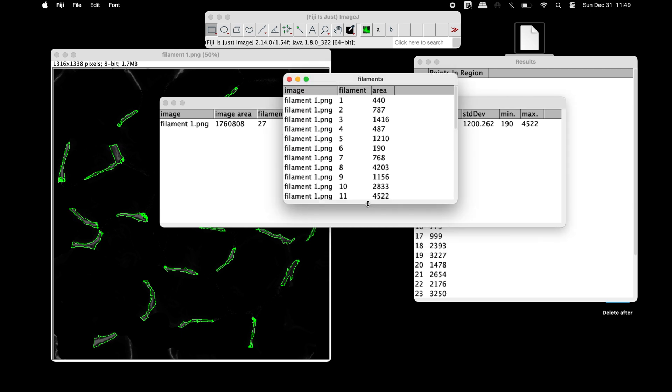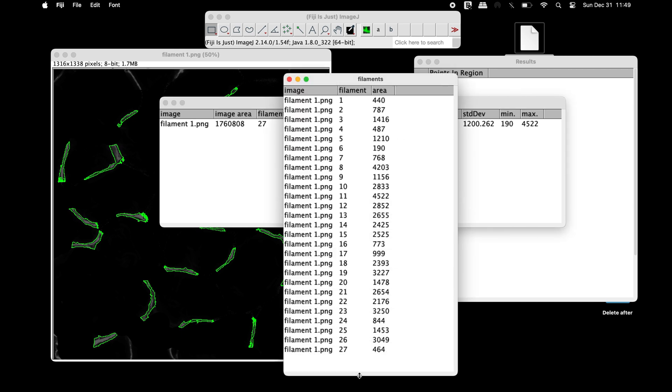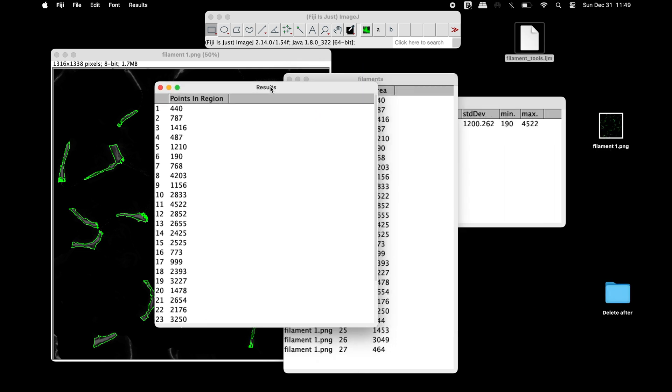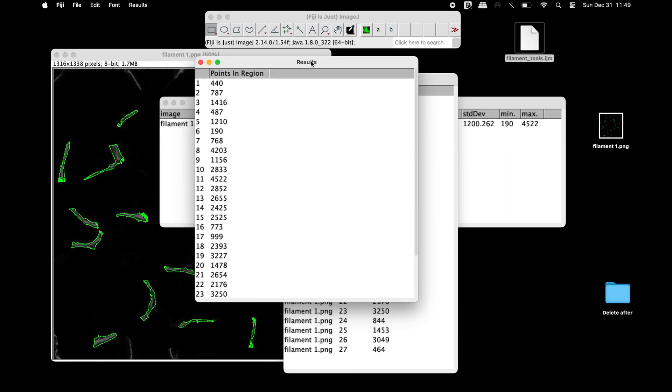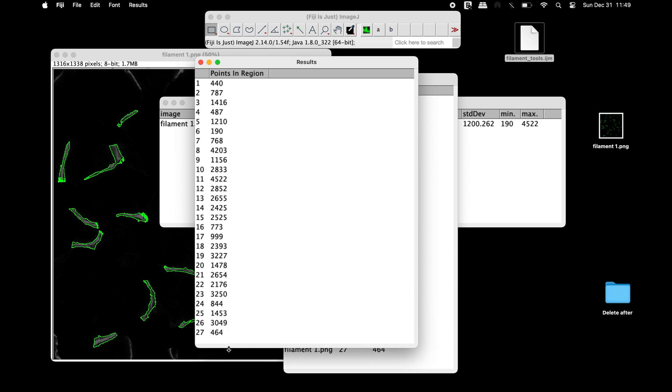In the Filaments window, the area for each of all the filaments are listed. In the Results window, the points in region for all the filaments can be obtained.